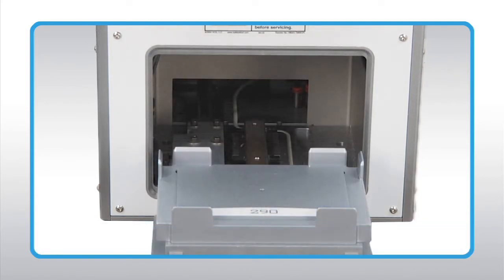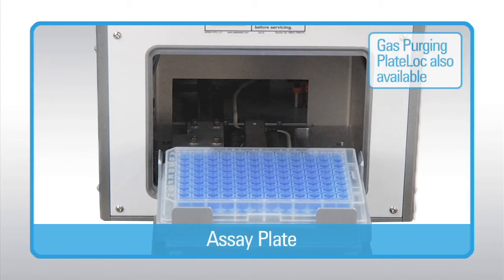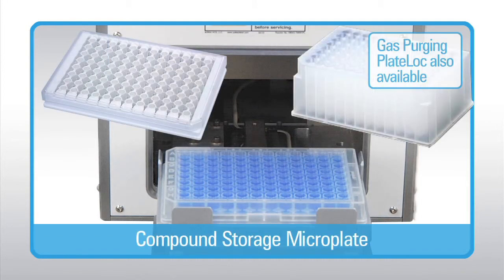The PlateLock Microplate Sealer automatically accommodates deep well, assay, PCR, and compound storage microplates.